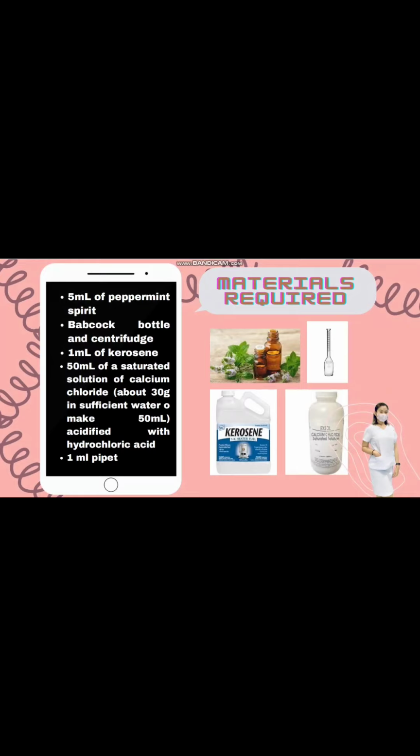The materials required are 5 ml of peppermint spirit, Babcock bottle and centrifuge, shown in the second picture at the top, 1 ml of kerosene, 50 ml of a saturated solution of calcium chloride, about 30 grams in sufficient water to make 50 ml, acidified with hydrochloric acid, and 1 ml pipette.